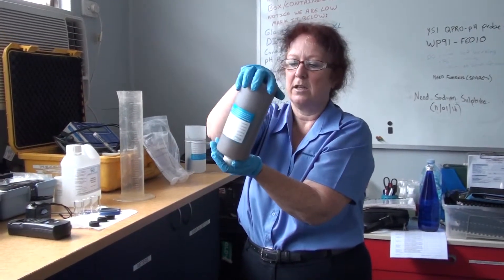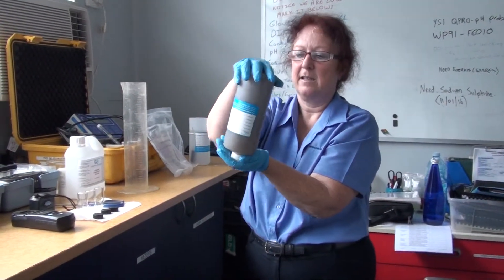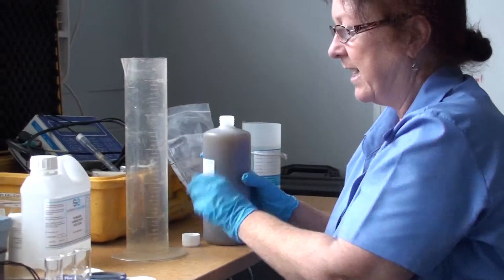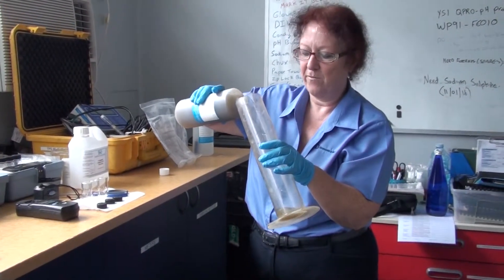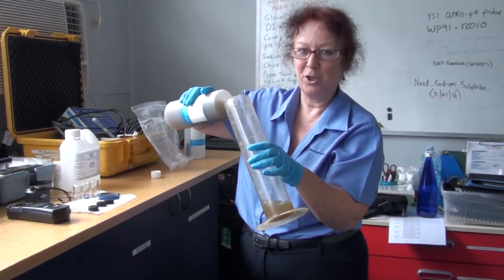So that's looking pretty good now — that looks fairly well-mixed. When you're filling your cylinder, don't just pour it all in like a bullet-a-gate. Pretend you're filling up a yardie or something and you're trying to get a nice little head on the top of what you're pouring up. Disclaimer: do not drink your sample.